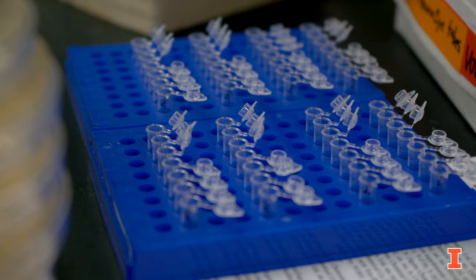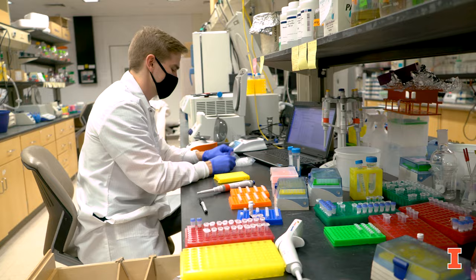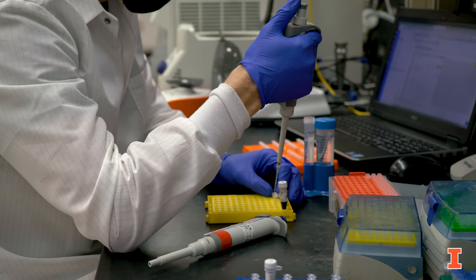Here in the lab we work on genetic engineering, synthetic biology, and metabolic engineering. We actually cover a huge range of different biological engineering sub-disciplines, and I am particularly working on a metabolic engineering project.